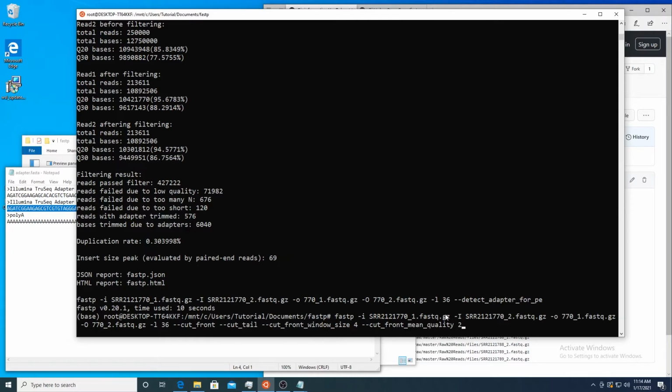There's also a flag that's called cut right. So if we back out here, what this is, it's similar to the sliding window option for Trim-O-Matic. So starting at the beginning, what is the window quality that you want and what length of window do you want? And this also defaults to 4 and 20 as before.